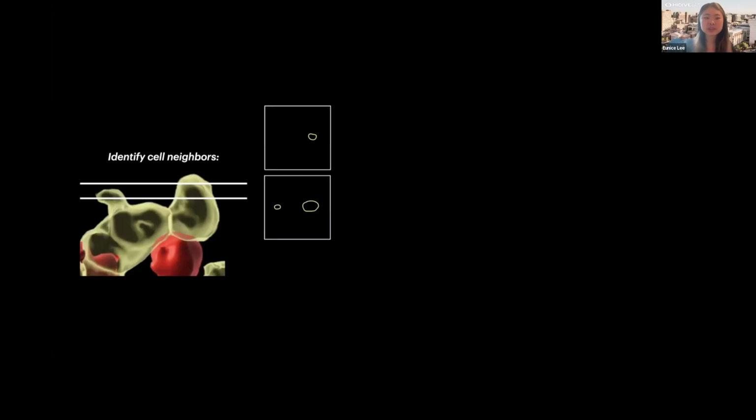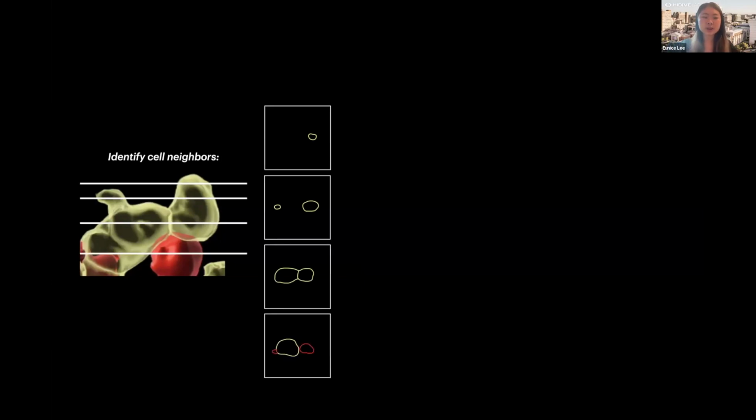And so looking at those cell neighborhoods, let's say we have this model of cells in a specific tissue. What do current microscopy techniques do with 2D based analysis? Well, it can slice through a top slice there to look at it from a top-down view, and we come up with this microscopy image of one cell representing this entire cell neighborhood motif. If we slice through a little bit down the z-axis, then we come up with two different cells now here. Slice through there, now the two cells are touching. And if we go even to the lower z-axis, then we now finally see the different red cells that were not even present in the slices above.